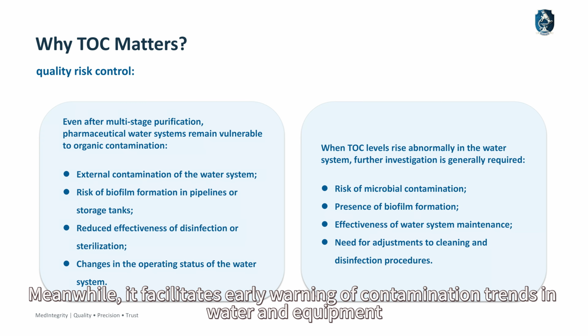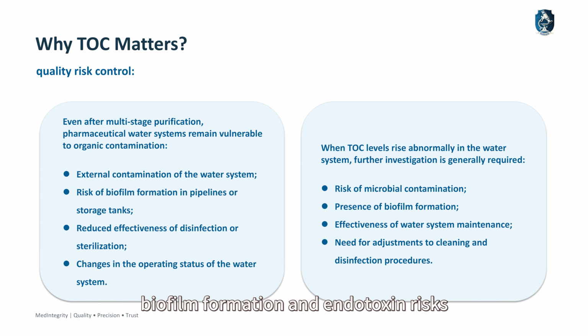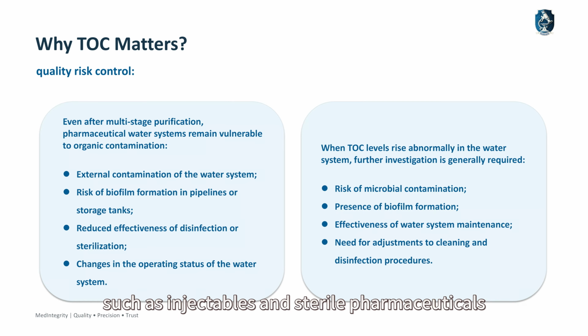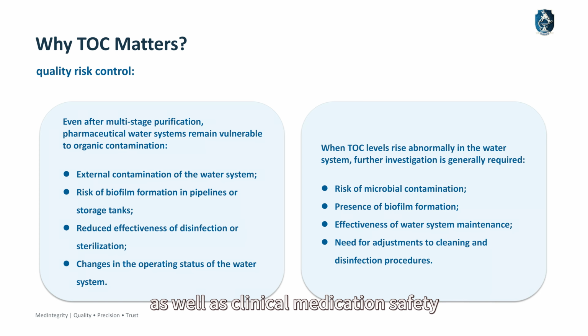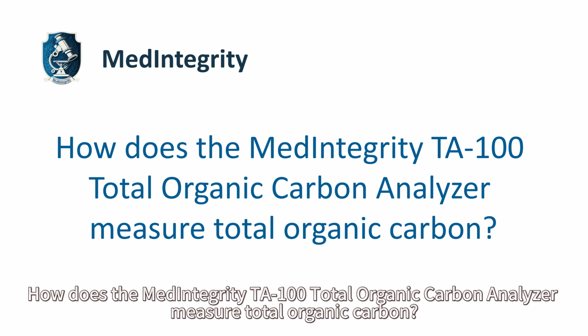Meanwhile, it facilitates early warning of contamination trends in water and equipment, mitigating microbial proliferation, biofilm formation, and endotoxin risks, so as to effectively safeguard the quality of high-risk preparations, such as injectables and sterile pharmaceuticals, as well as clinical medication safety. How does the MedIntegrity TA-100 Total Organic Carbon Analyzer measure total organic carbon?